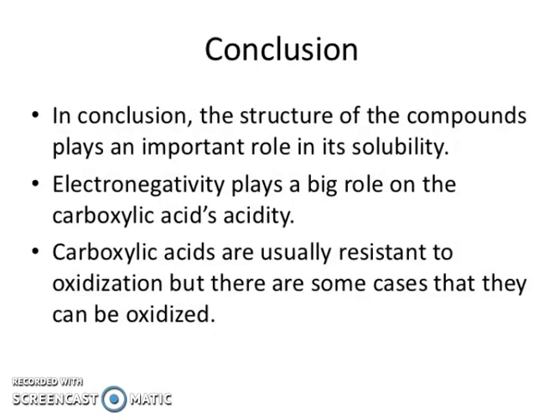Then conclusions. In conclusion, the structure of the compounds plays an important role in its solubility. Electronegativity plays a big role on the carboxylic acid's acidity. Carboxylic acids are usually resistant to oxidation, but there are some cases that they can be oxidized.